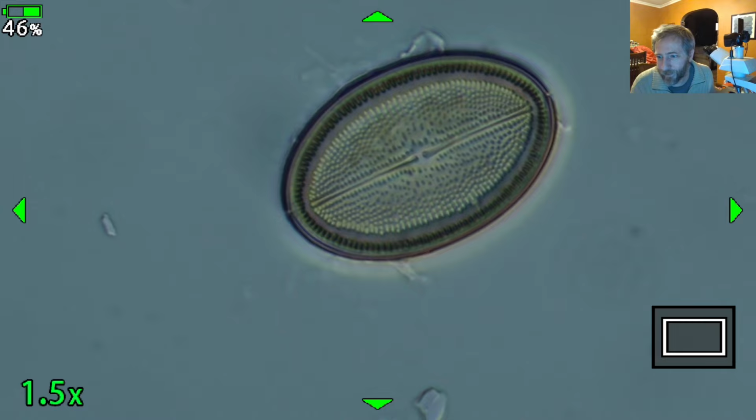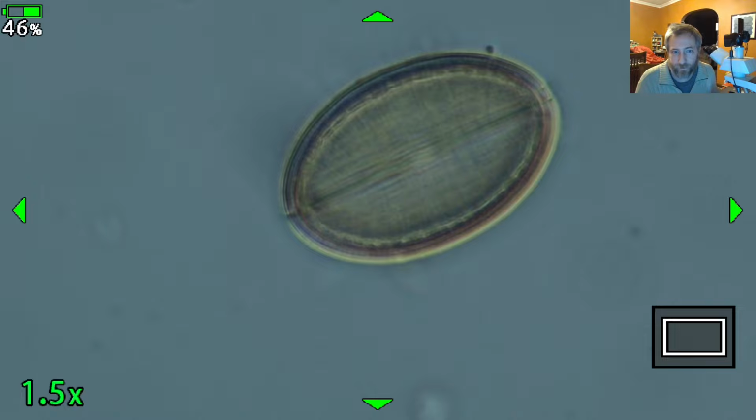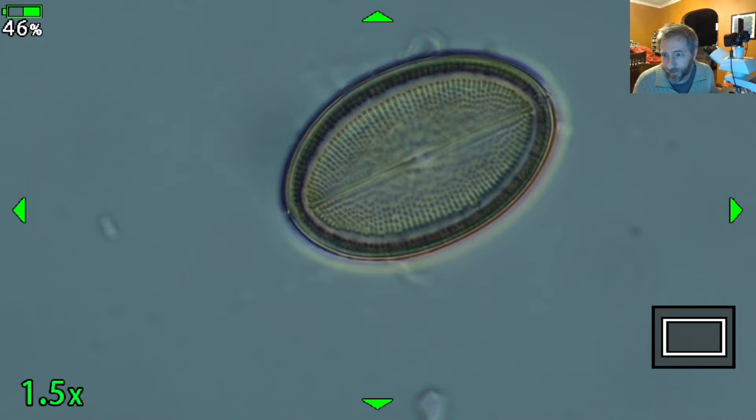Do diatoms have chloroplasts? They do. They're algae, and so in their living state, they would have chloroplasts present in them. The colors are fake, it's true. Sorry. They're colored by me in Photoshop or Lightroom or whatever.